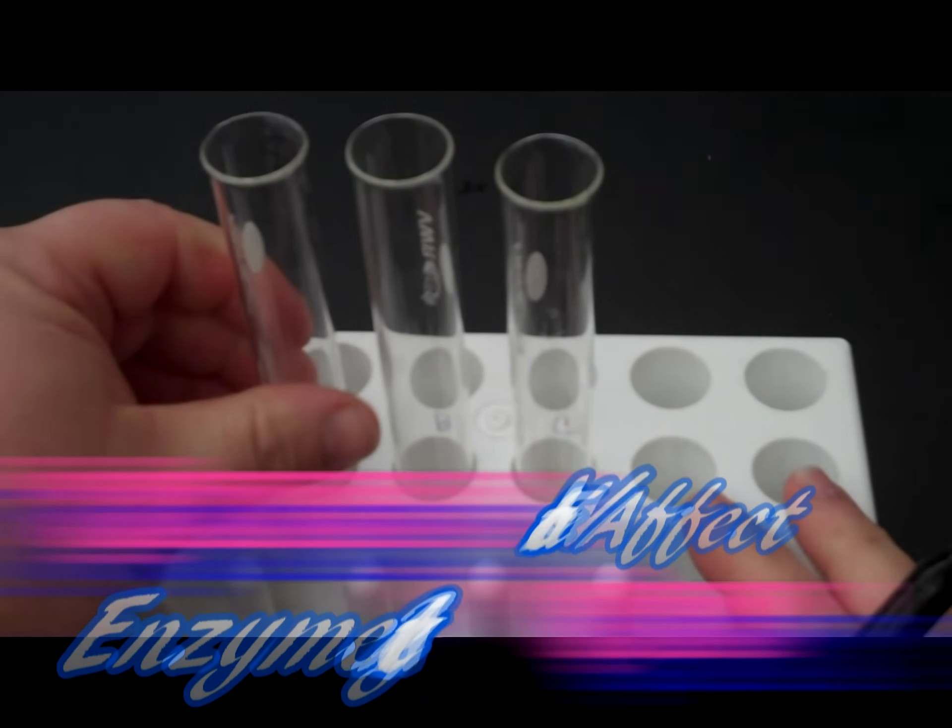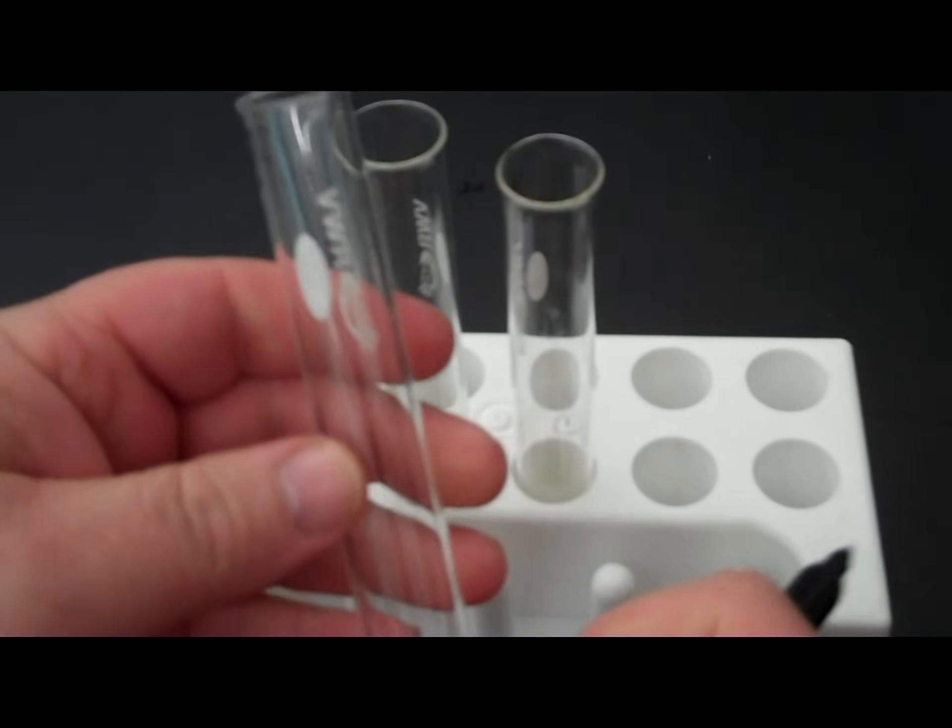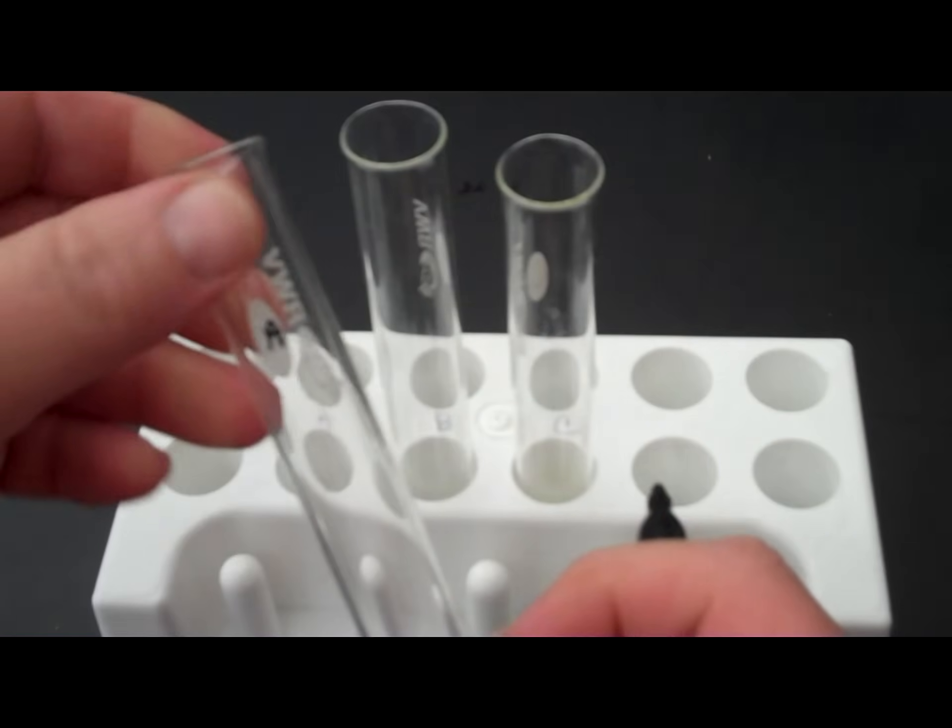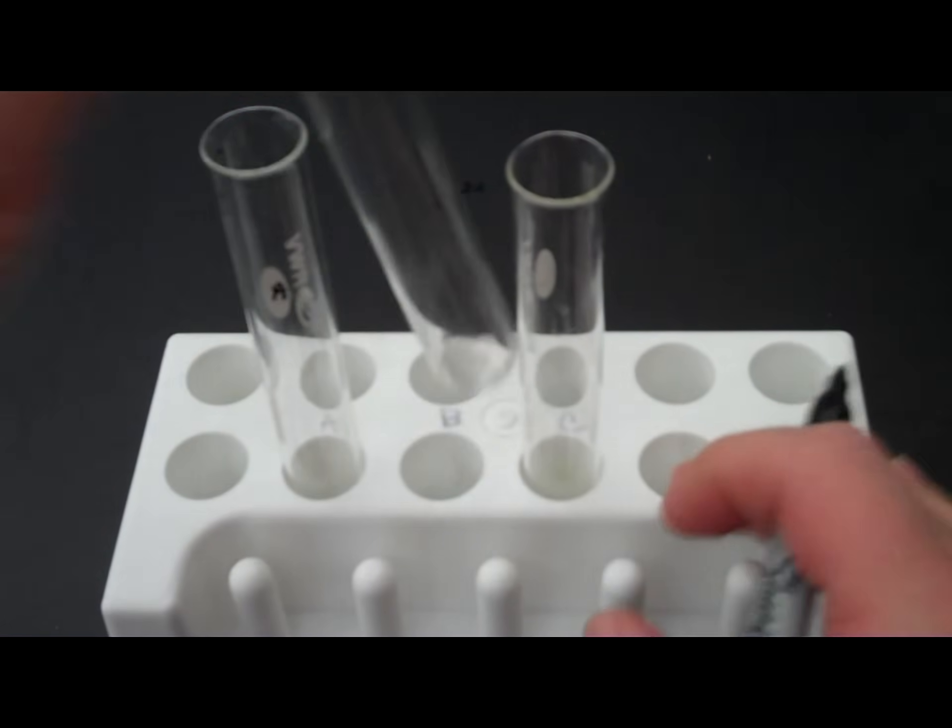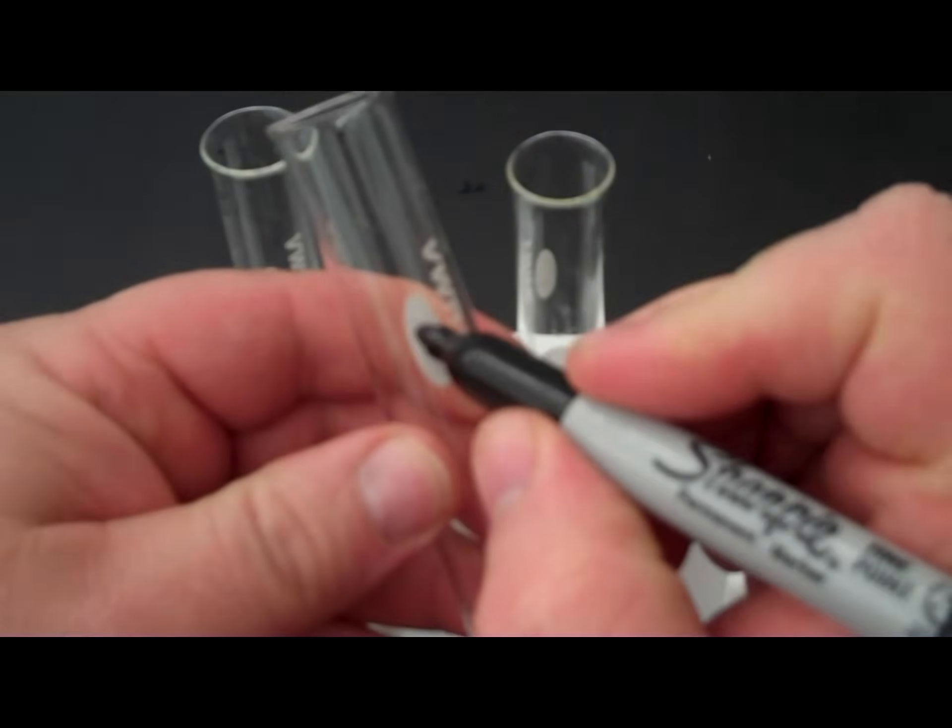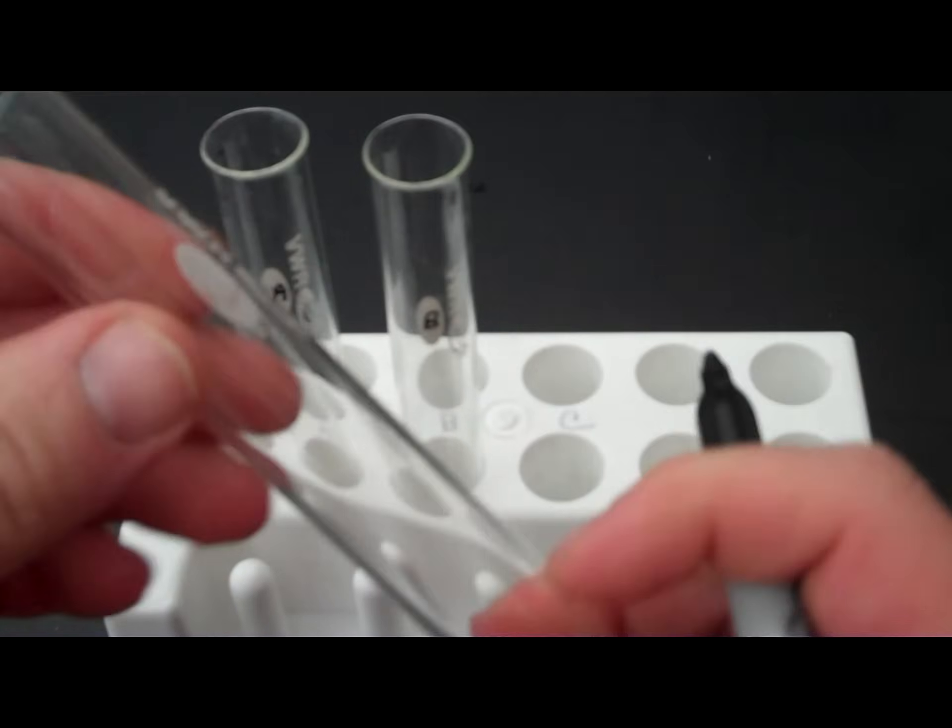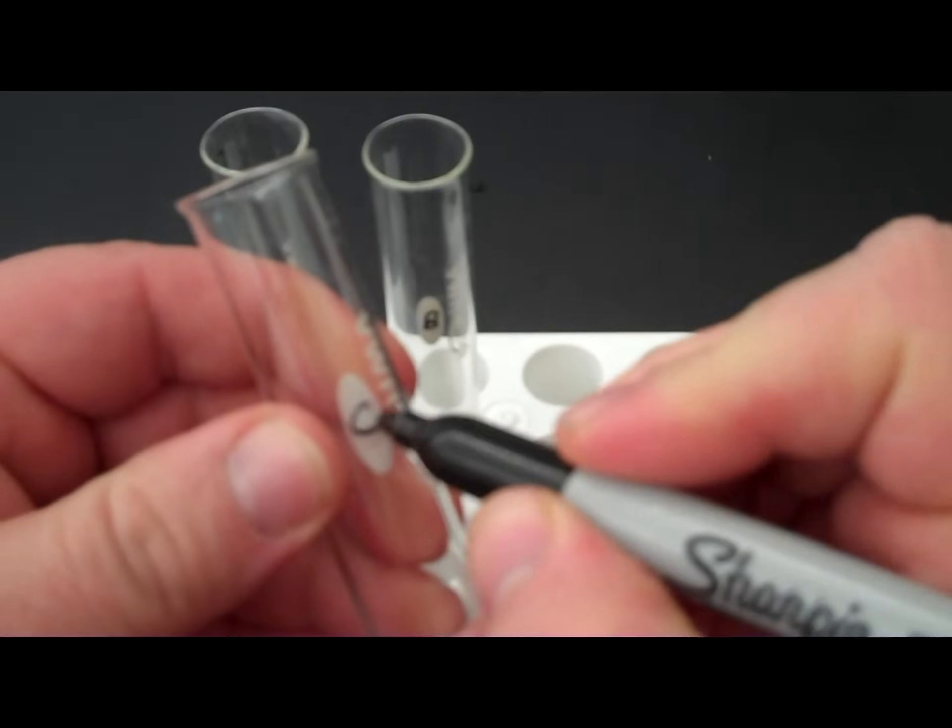So, I'm going to take my test tubes, and I'm going to write test tube A on one, test tube B on the next one, and test tube C on the third one.